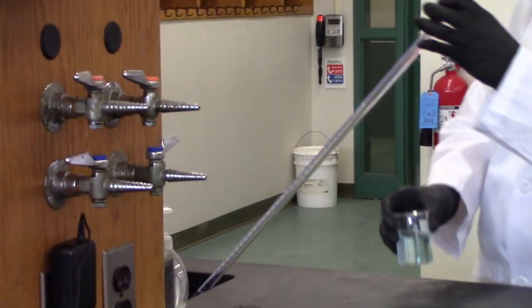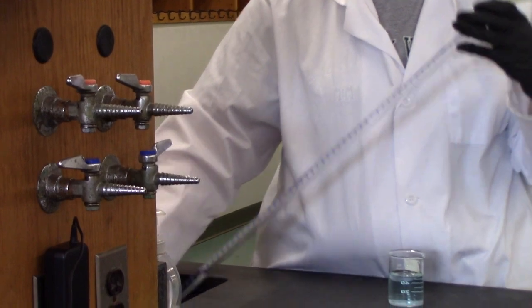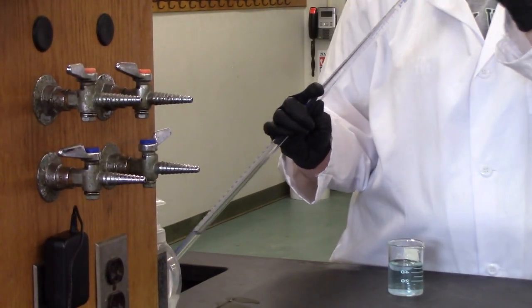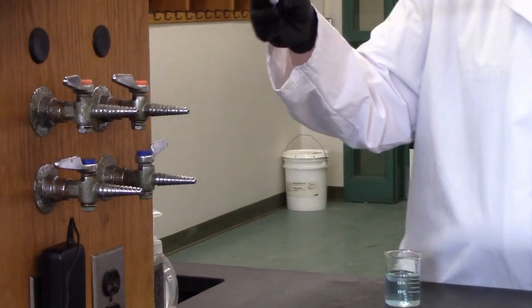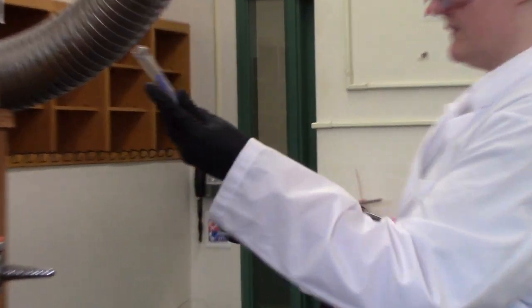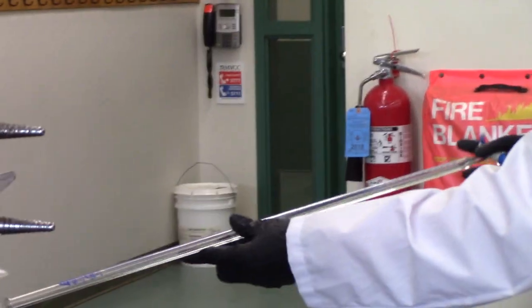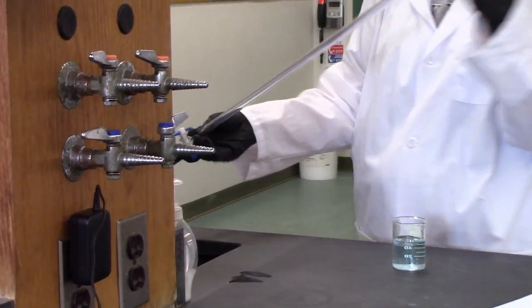All right. You don't have to fill the entire buret to rinse. I let a little bit drain out, okay? And then what I'm going to do is take my funnel out, and you can turn it and let it leak out. You can even put this end into the sink and turn it and let it drain out that way, okay?